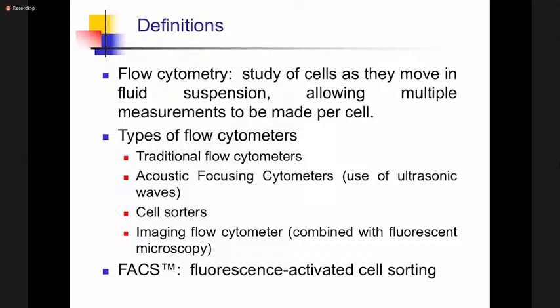And this one implies that fluorescence-activated cells are separated from those which could not be activated. And what it does is very good. I was very impressed. You want to separate a population of cells. For instance, you students by now have a little knowledge, if not much, that a cell infected by Kaposi sarcoma-associated herpes virus, or by Epstein-Barr virus, leads to a number of tumors, including non-Hodgkin's lymphomas and also primary effusion lymphoma in the case of Kaposi sarcoma-associated herpes virus.